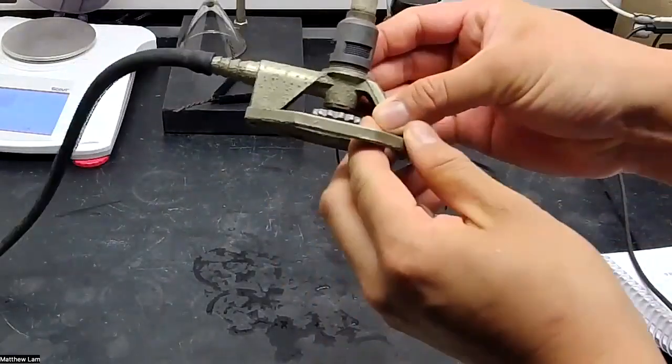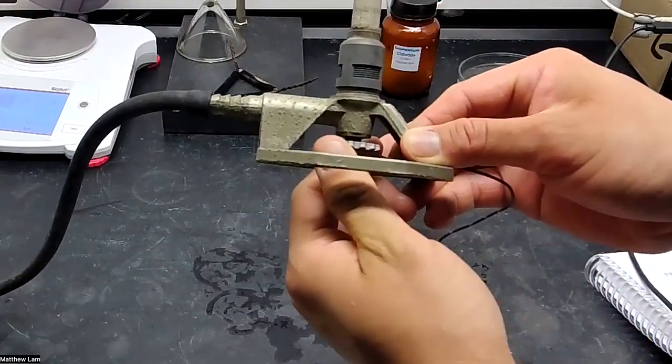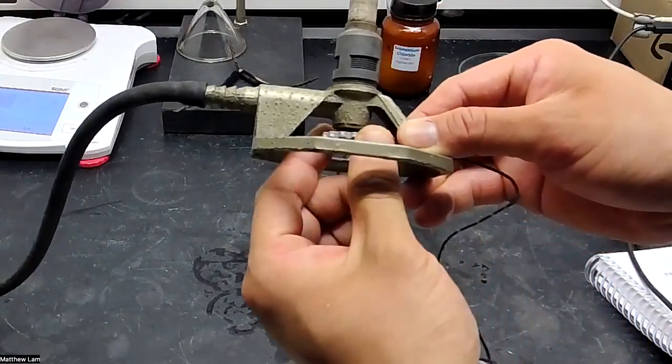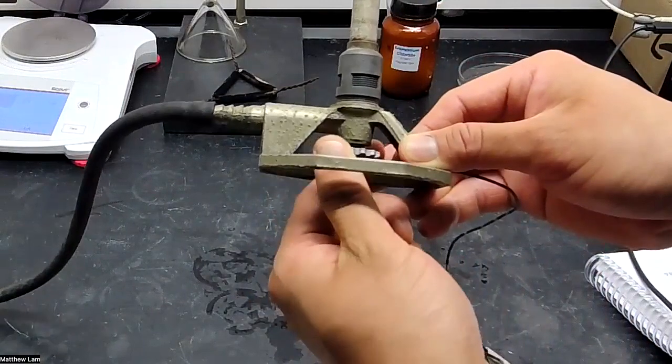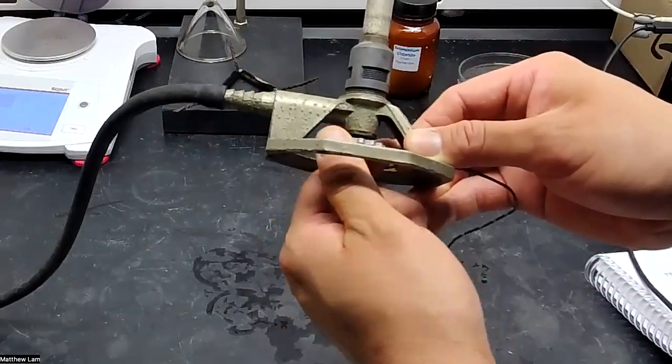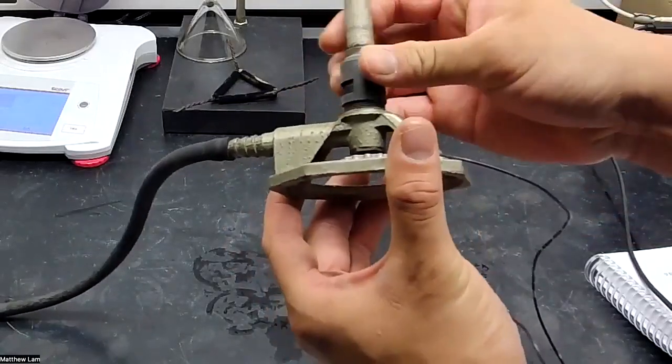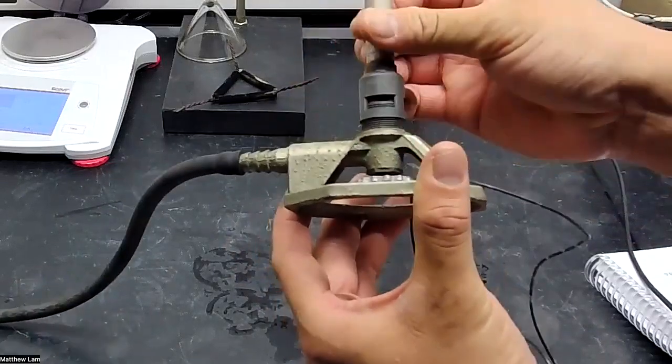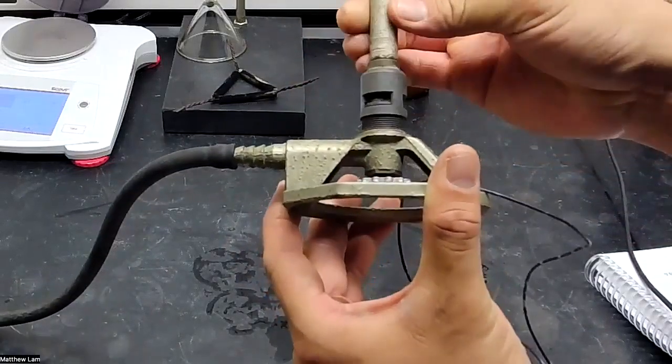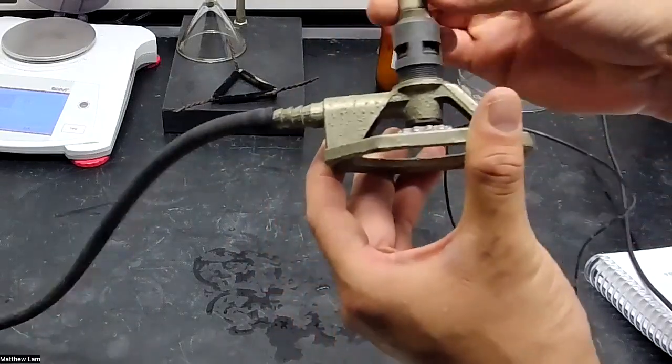Now, there's two functions on the Bunsen burner. As you can see here, there's a knob back down here where you can control the amount of gas that comes into the Bunsen burner. If you turn this, it can increase or decrease the flame. Here, we'll increase the amount of oxygen that is introduced to the Bunsen burner.